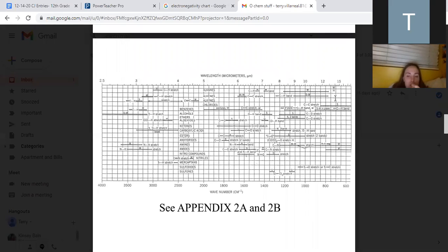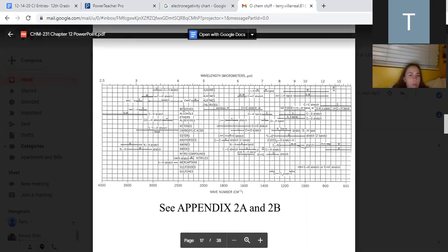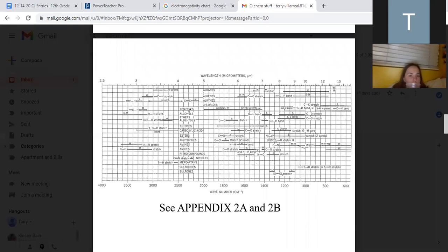Like it was rough. But the idea here is that we can see a lot of things in this, and it's very easy to get lost unless you just know what to look for. Meaning, there are some things that take a little bit of time to say, I think this might be this functional group. So, for example, can you see here, I have my mouse over benzenes, alcohols, and stuff like that. So, you have carbon carbon double bonds. So, you could have a lot of things that are just overlapped with each other, right?